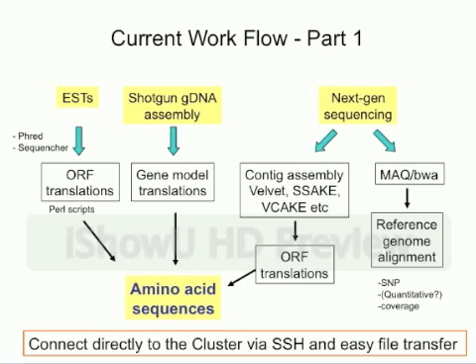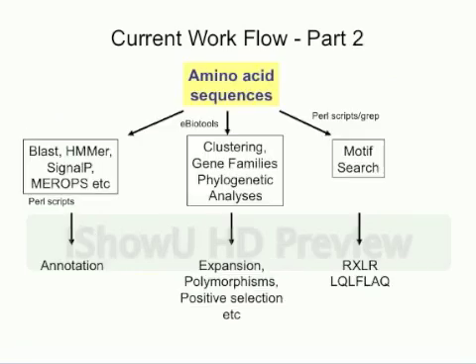Okay, so you can do all this on the cluster, but Mac can come in and then connect you to the cluster. You can download and upload sequences quite easily. So that's another reason that you use Mac. And another follow-on workflow that we use Mac for is this.